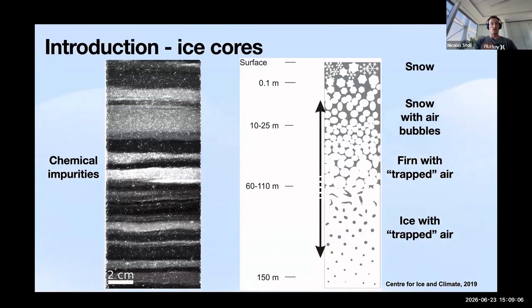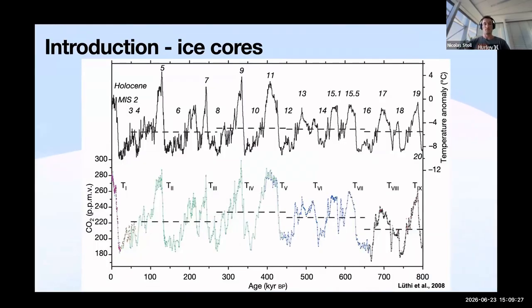So here's an image of layers in the ice. This is a method called dark field analysis. The brighter the spots are, the more impurities are in the ice, reflecting light back towards us. So you can see bands and layers of dust particles, for example.